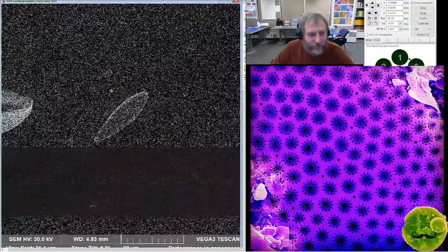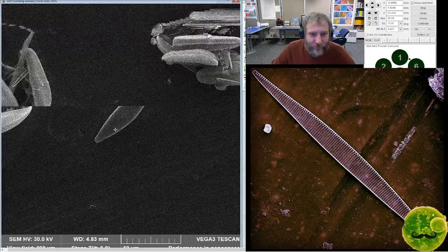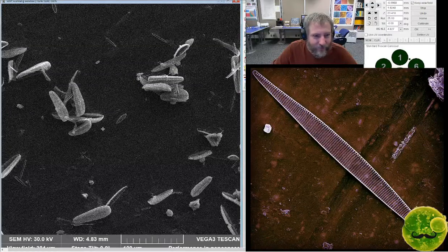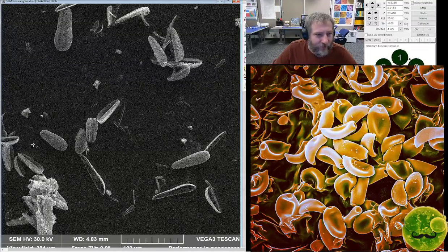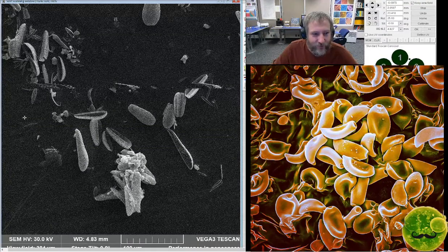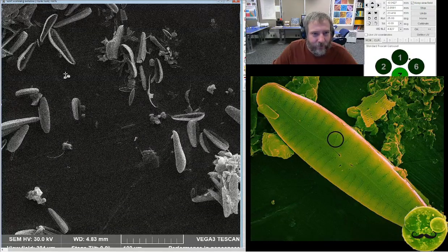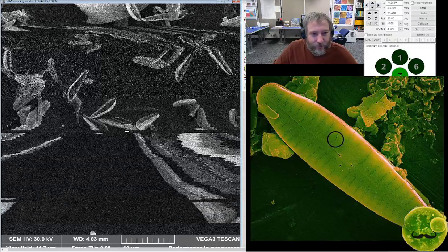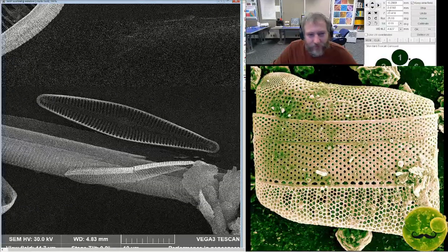One of those things about the sample is it's full of these little asymmetric diatoms, and they're the ones I was questioning. We have this publication for some of these Afrocymbellas basically ready to submit. And this was one of the things that my co-author, collaborator, Itzi, wanted me to check out, was whether these were Afrocymbellas or not.